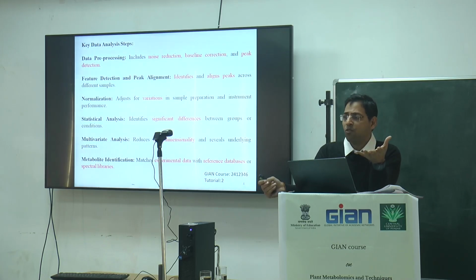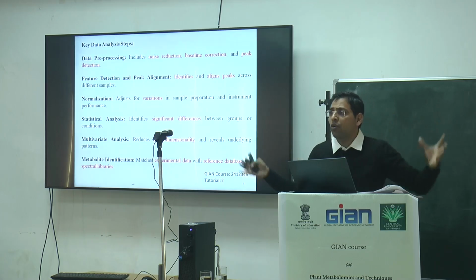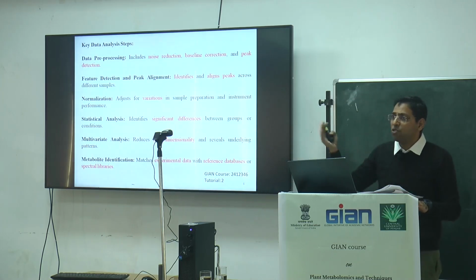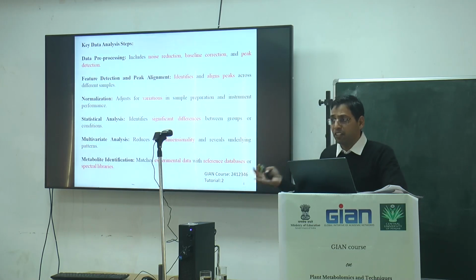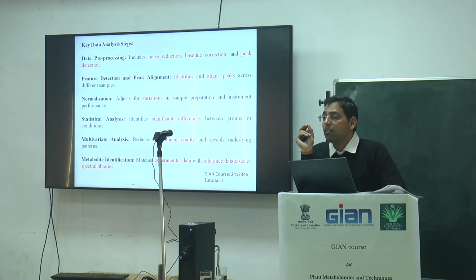Temperature also influences the flow rate and the separation of the analytes from the column to the solvent, and from the solvent to the column. Retention is going on continuously. Diffusion, eddy diffusion is also in play, a critical role here. So you have to find out which component of chemical charge of that chemical is responsible for that peak.